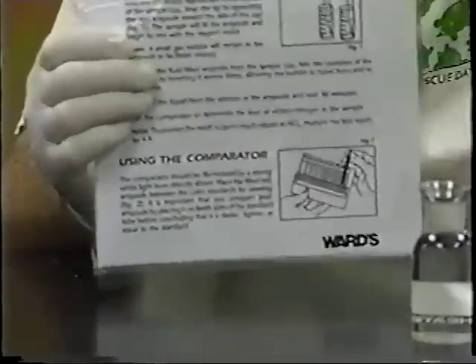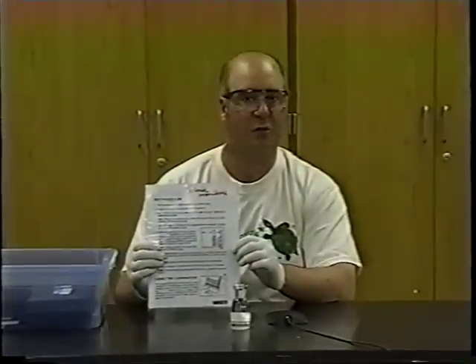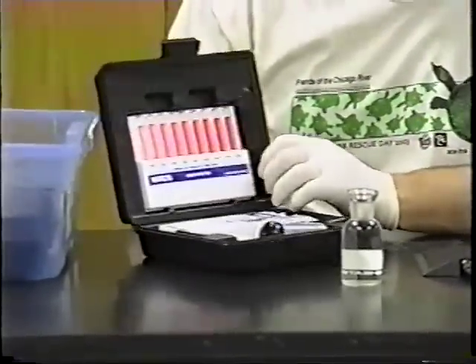I highly recommend that as you do the test, you go through the instructions step by step, even though it's very simple. We'll follow the procedure as outlined in the instructions so that there aren't any errors or questions about the validity of our data. We're going to start with how to perform the nitrate test. There is a kit specifically called the Nitrate Kit, and when you open it up, you'll find all the equipment you need to run that test.